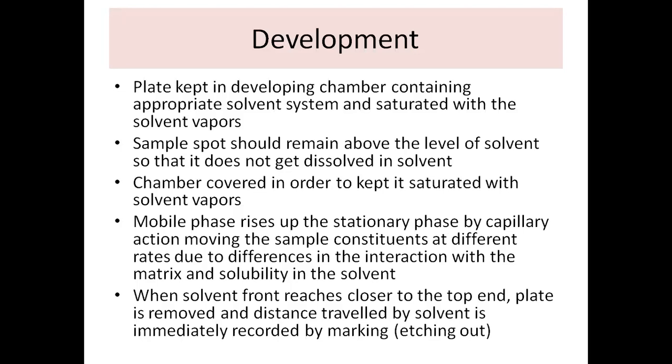And that is an equilibrated reaction. Therefore, some amount of the sample will be carried by the mobile phase, and some amount will be retarded on the stationary phase. When that happens again and again, that results in the sample spot moving up the stationary phase.